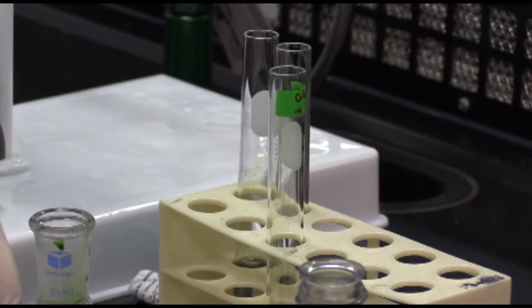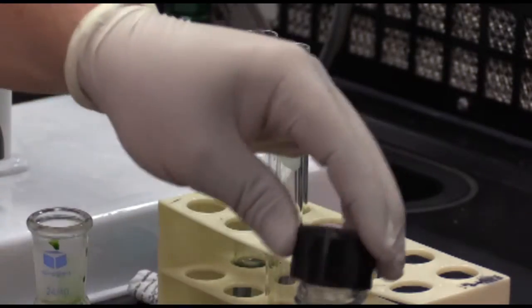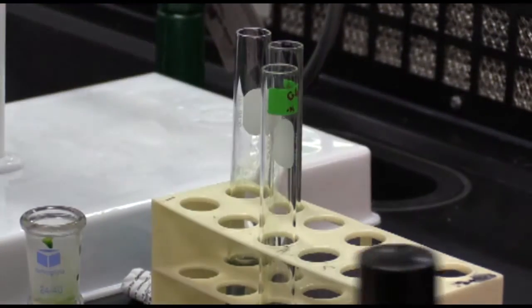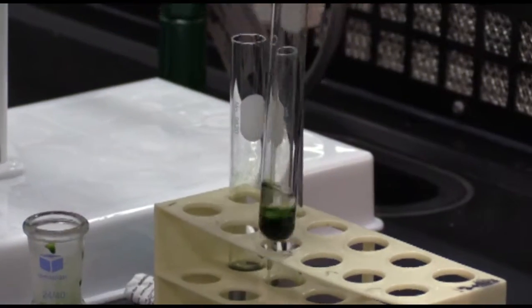Take off the bulb, place the pasteur pipette back down, close the pet ether, move that to the side, and grab the test tube.